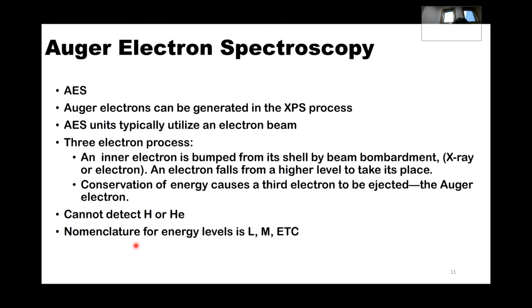You can't detect helium or hydrogen. And here, the nomenclature for the energy level is LM, etc. I guess I could have put KLM. Don't know what I was thinking. But anyway, let's take a look at a cartoon, and then we'll work out a problem.